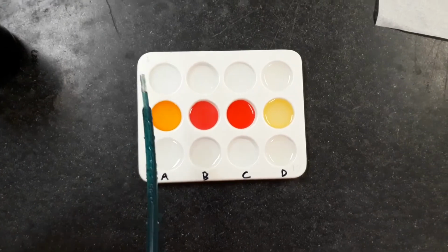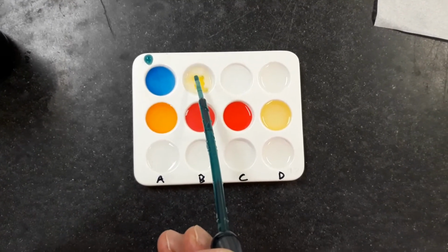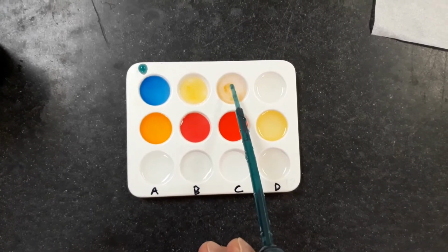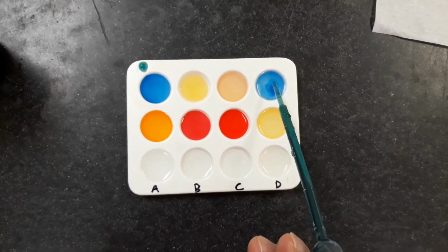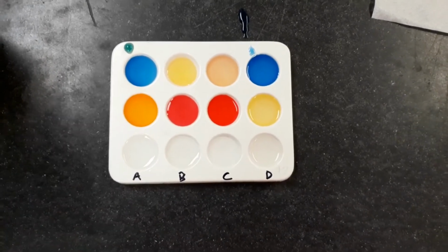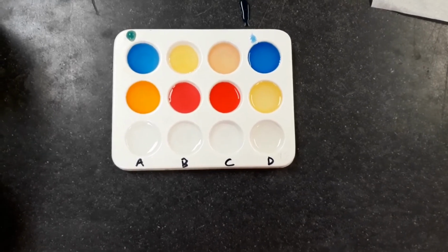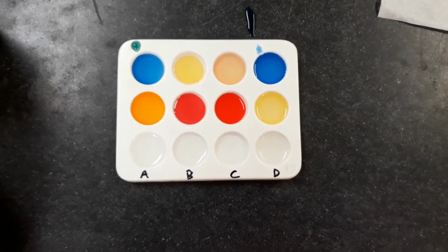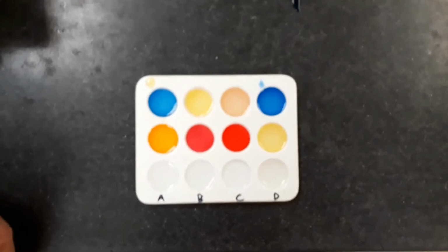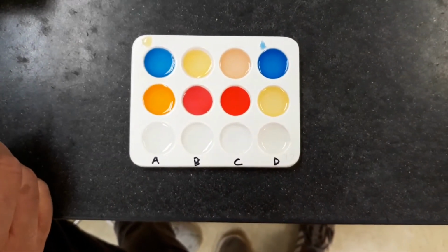And now for bromothymol blue. Bromothymol blue is blue in base and kind of yellow or green in acid. Okay, I misspoke. The bromothymol blue is yellow or orange in an acid.